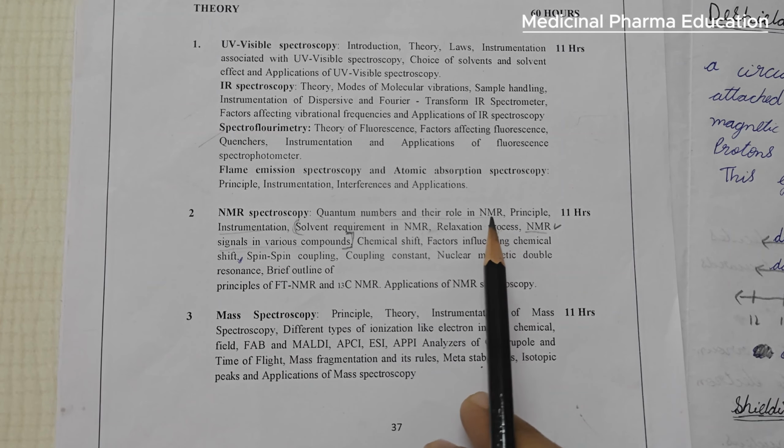Next, an increase in the electronegativity of the surrounding groups will result in a decrease in the electron density and lead to an increase in the chemical shift value due to the deshielding of the nucleus. We have already discussed that if an electronegative atom is present, then automatically deshielding is caused, and where deshielding is caused, the shift goes to a higher value. In deshielding the range is higher. That's what electronegativity is about.